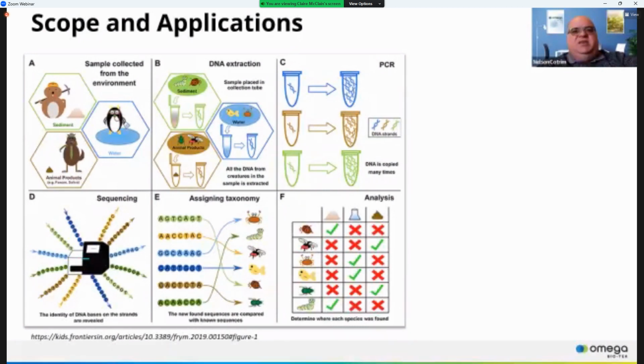These will allow for the identification of each of the species present in these samples, allowing for taxonomic classification based on the known sequences of biodiversity surveys. With advances in next-generation sequencing technologies, it will be possible to derive information and analyze entire communities simultaneously from a single standardized sample. The potential for using environmental samples is immense.